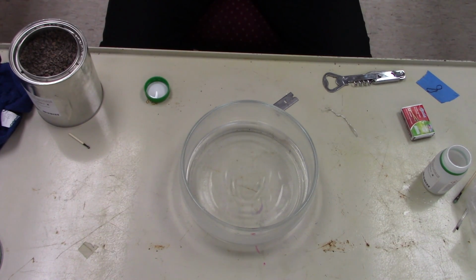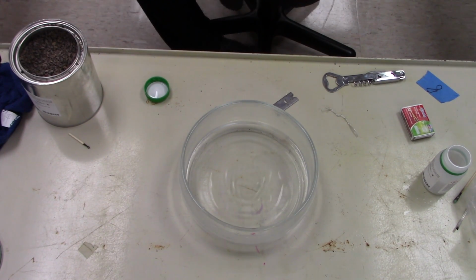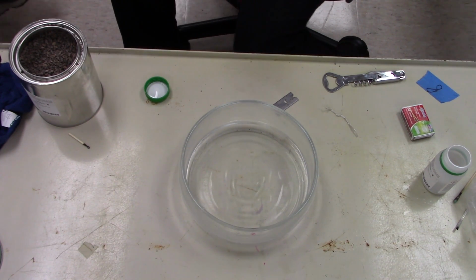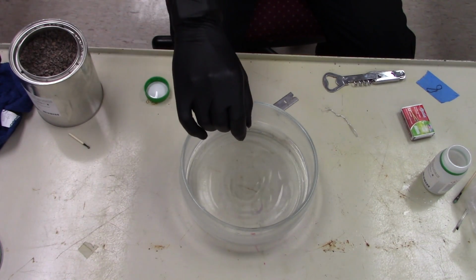So sodium hates water. It absolutely hates it. I like water. I drink water and it makes me happy. But when you put sodium in water, if you look at the board, that's what's going to happen. This is going to split apart the water molecules, and part of the water molecule is going to bond to the sodium, forming sodium hydroxide, I believe that's called. And then you're going to hear fizzing, and the fizzing is hydrogen gas forming.